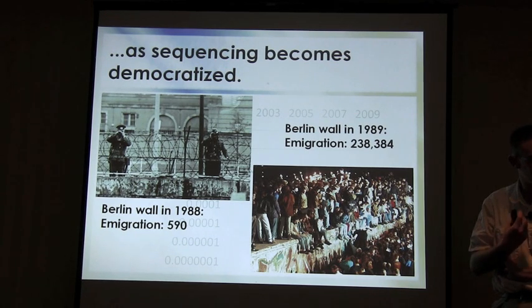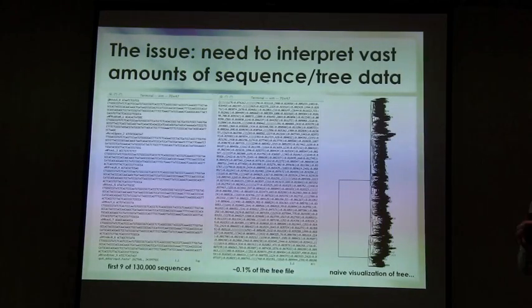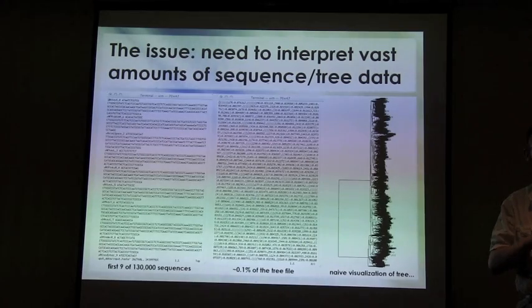And it's relatively likely that sequencing instruments are going to go the way of, say, PCR machines, where a couple of decades ago they were very expensive, but now many of you probably don't even know how many PCR machines you have in the lab, right? And so sequencing is going the same way with a huge democratization of the techniques.